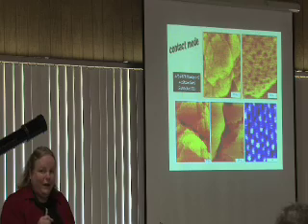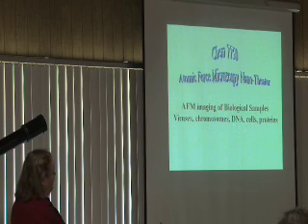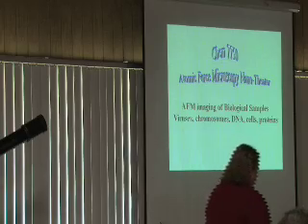I have some more biomolecules that in a few minutes I'll show you. So that's what some pictures look like. Part 3, biological. Okay, we'll move right into that. And I have to confess, this comes from a college laboratory, a college lecture.